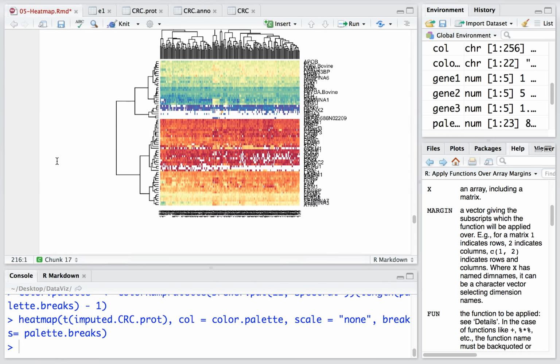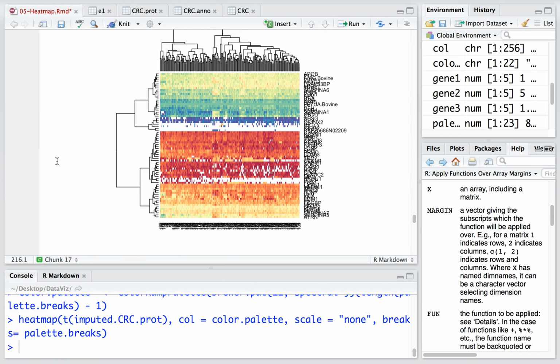See, that's the new heat map. We changed nothing, just changed the color. It's different. But can you see why there are almost three or four groups of protein colors? Because each row has a different protein color. Any idea why the color is so different between the rows? Because some proteins are just high abundance proteins. Like the protein abundance is different. For the previous one, I think it's low abundance proteins, and here they are high abundance proteins.